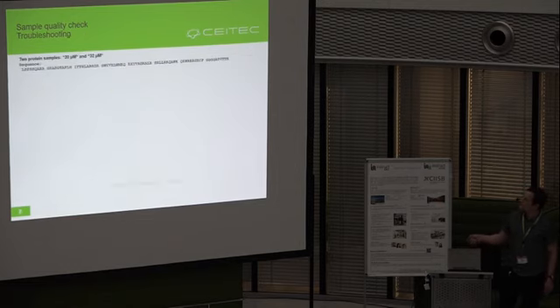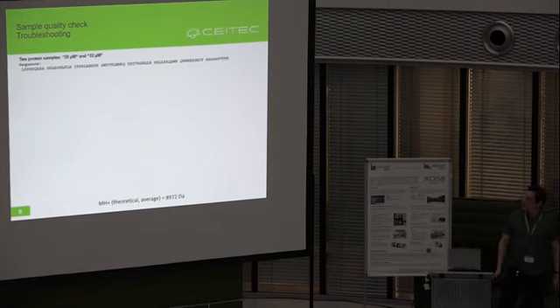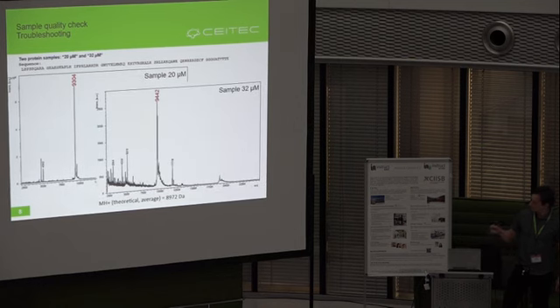In the following example, we will show you an episode from our core facility life, when our customer brought us a protein sample to check its identity. We obtained this sequence from the customer. There were 2 samples, and the concentration is here to distinguish between them. They had 2 names based on the concentration. The calculated mass of the protein was this one. However, when we look at the result of the mass spectrometric analysis, both samples showed a different value.